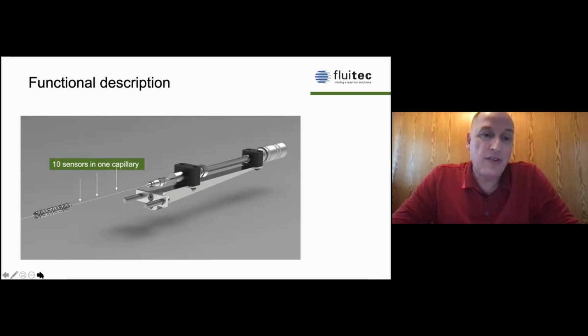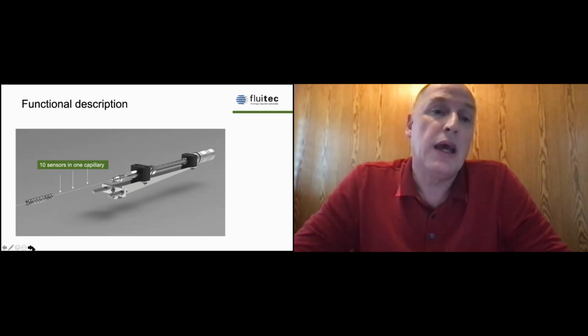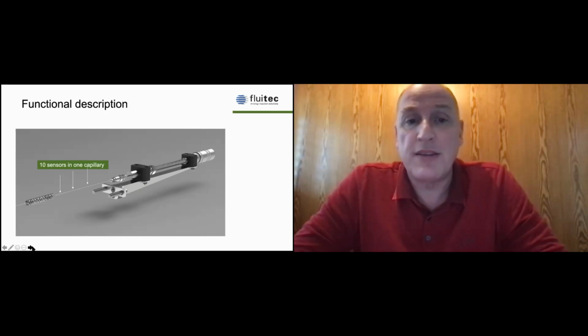The static mixer has more jobs to do in the reaction calorimeter. One thing, of course, is premixing, but that can be done in another way. Another thing is that it has to create a residence time distribution. That means the residence time distribution of the reactor has to be very narrow. And finally, the measurement of the temperature sensors.